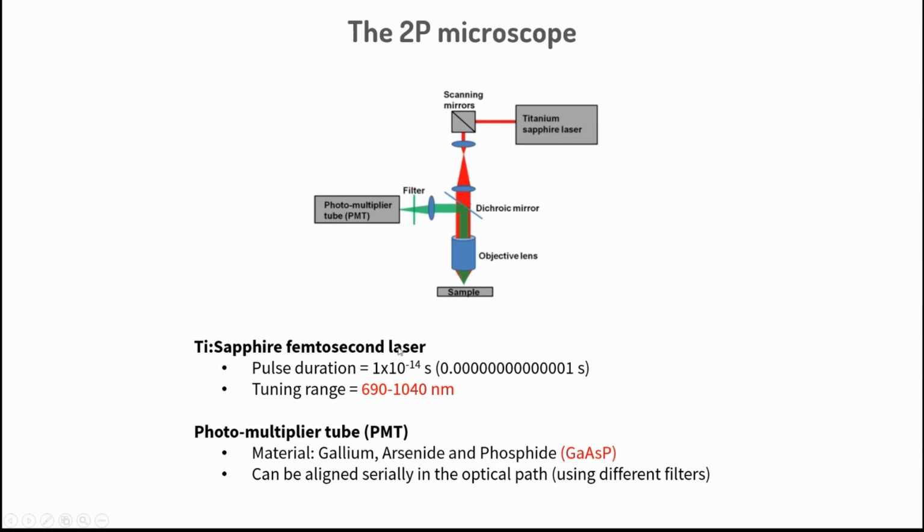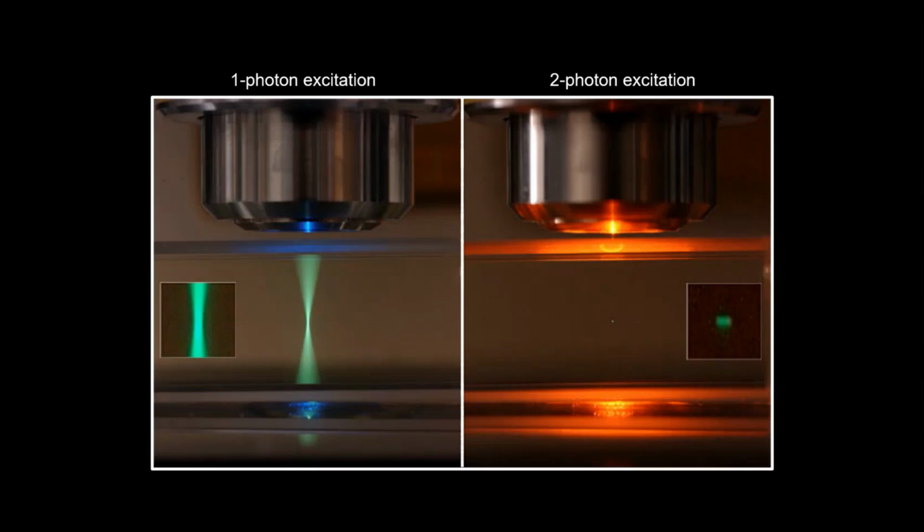And it's called the femtosecond laser because it will emit a pulse of millions of photons, but at pulses that have the duration of 10 to the minus 14 seconds. So very short pulses. These pulses are so short and so sequential in time that you are sending a huge amount of photons to the same place, and this is what happens here at the focal plane. So I'm sending a lot of photons to this tiny spot in the middle.